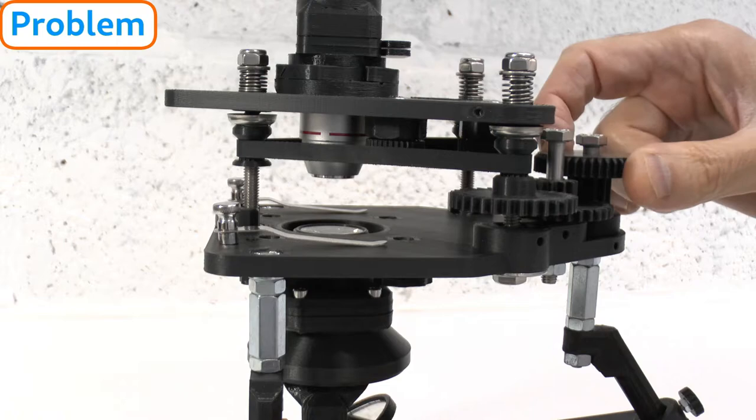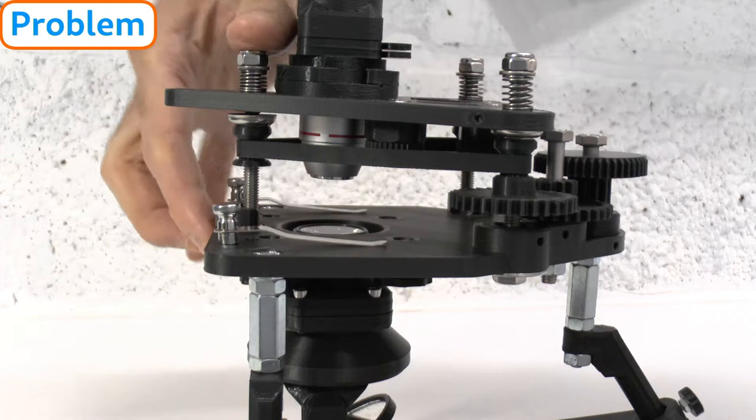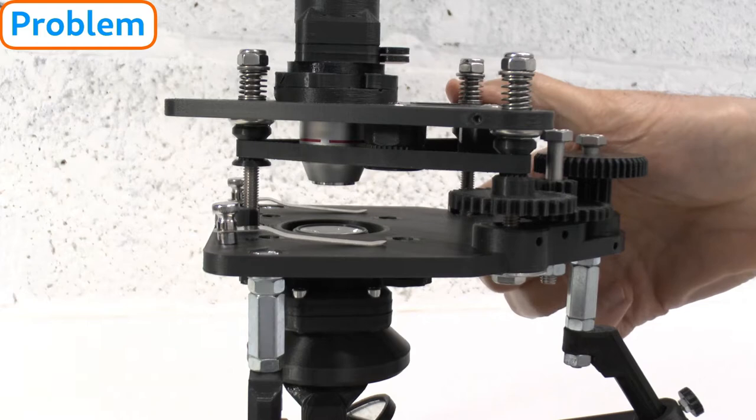This problem occurs if the PTFE ferules in the adjustable articulations cling too tightly to the focus bolt threads, and the focus springs are not strong enough to keep the focus plate applied to the tops of the focus post pulleys.